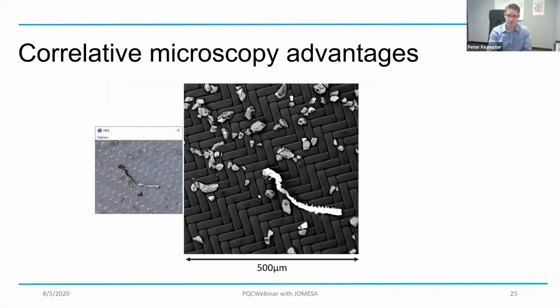And this is just a few other pictures. This is silicon carbide, I believe, surrounding another metal chip. Wow, very abrasive, yeah. Yep, so it's really hard. You can see the shape of it. It's very sharp. And you can tell that the filter background itself is carbon-based, and you can see that that's very dark, and the particles themselves are bright.